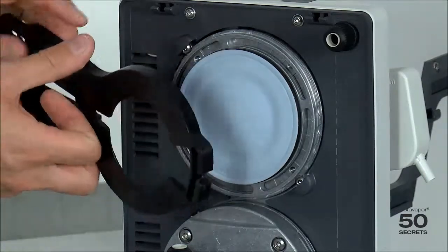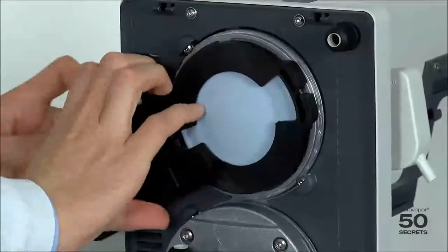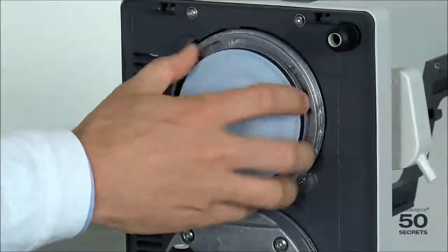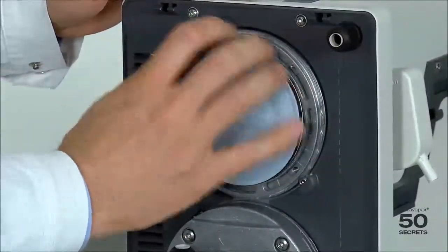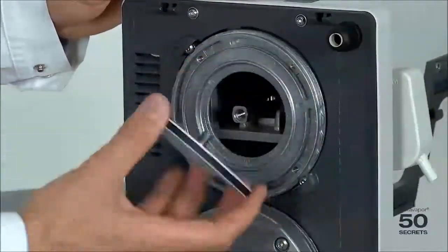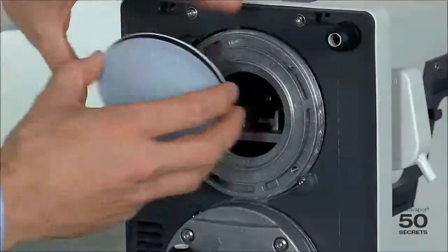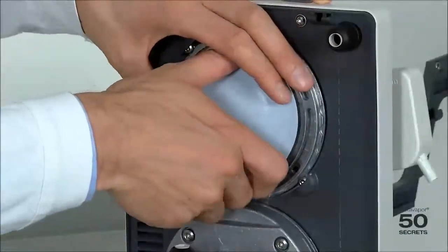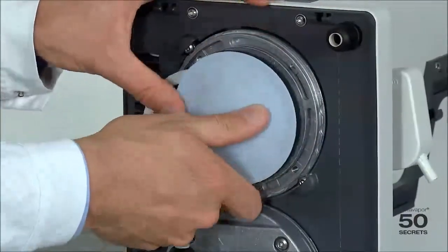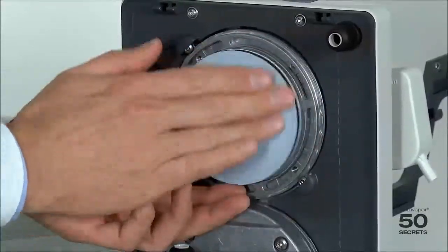Now we use this tool and release it in one direction — it has very nice marks here indicating open and close. We can then use our fingers to take the complete membrane out. Once we have this out, we simply take the new one and put it in, making sure that the ring is in the right position.